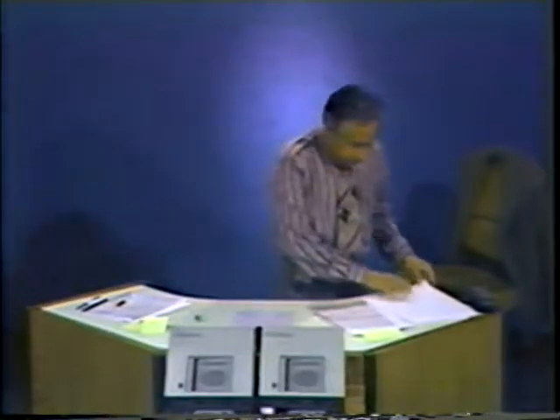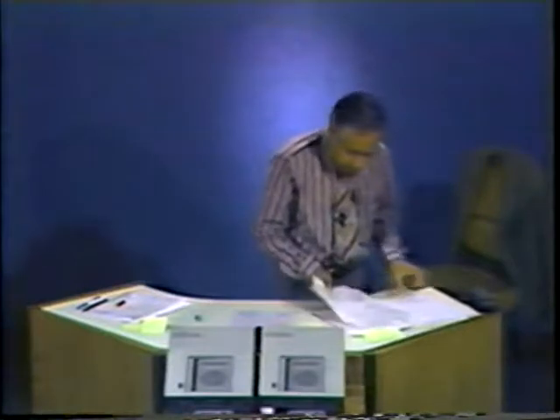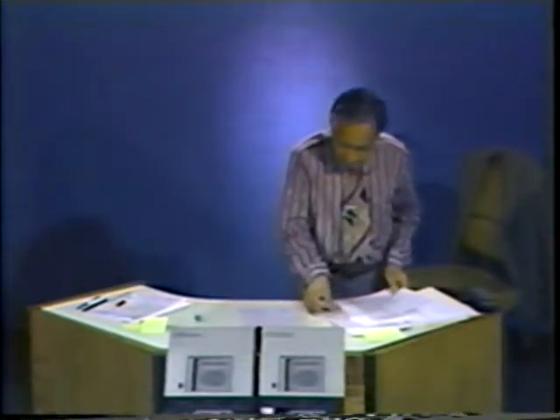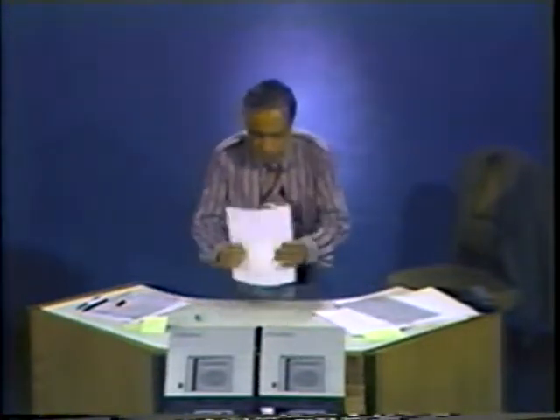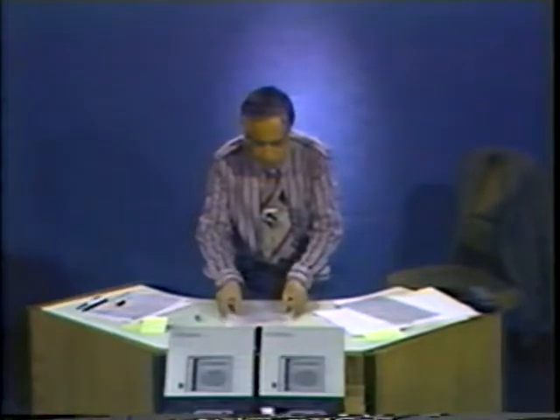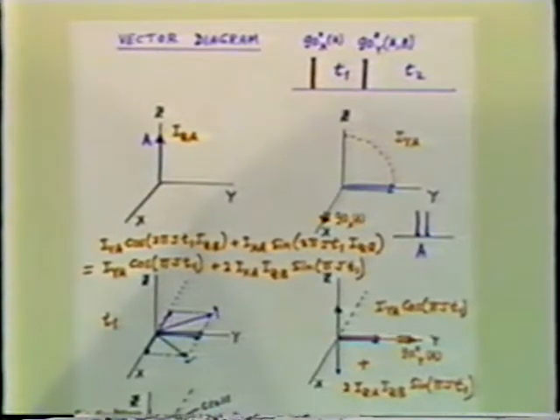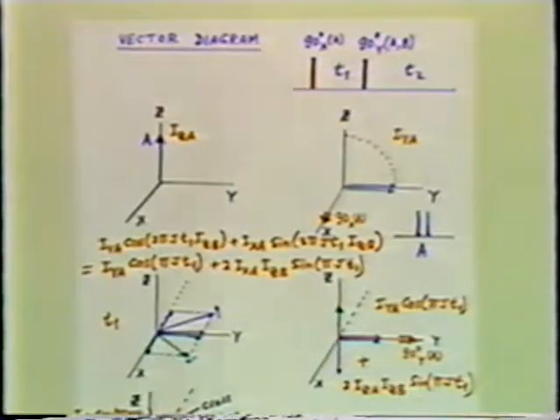Now, the product operator method is actually somewhat similar to our vector diagram, except that it's a bit better. What I've done here is use this product operator method that I just told you about and superimpose it upon the vector diagram picture. Then we see that we can follow quite a bit.